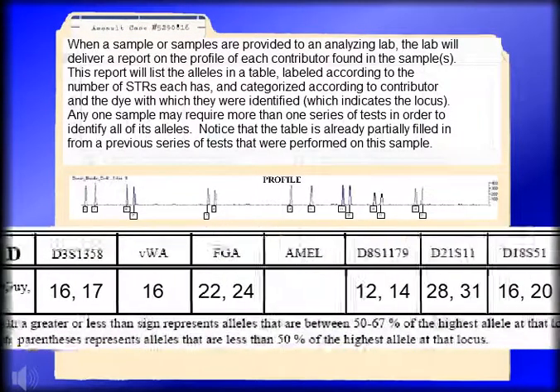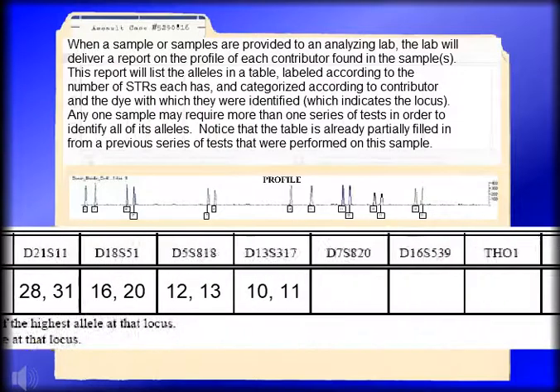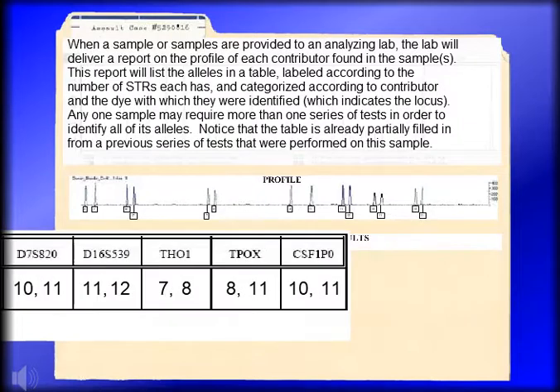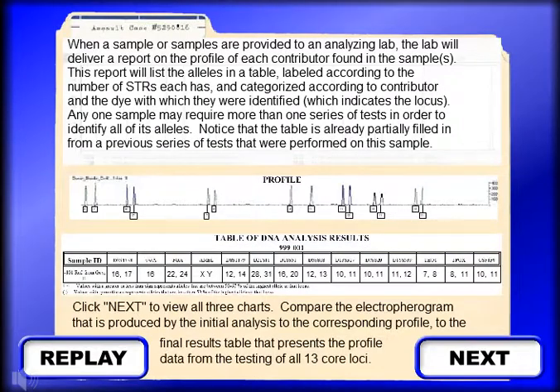When a sample or samples are provided to an analyzing lab, the lab will deliver a report on the profile of each contributor found in the samples. This report will list the alleles in a table, labeled according to the number of STRs each has, and categorized according to contributor and the dye with which they were identified, which indicates the locus. Any one sample may require more than one series of tests in order to identify all of its alleles. Notice that the table is already partially filled in from a previous series of tests that were performed on this sample.